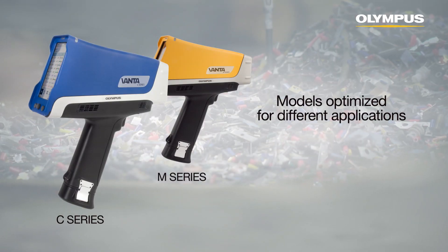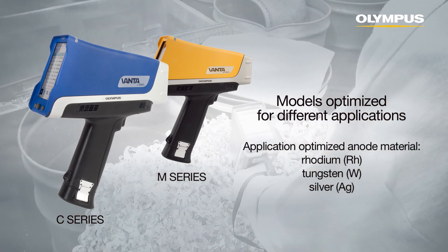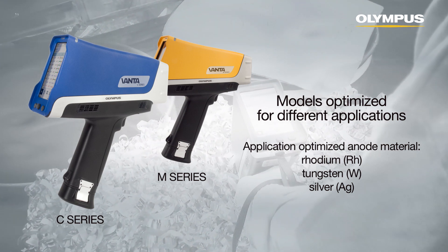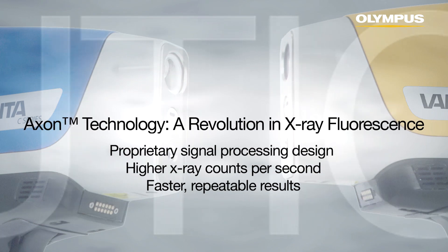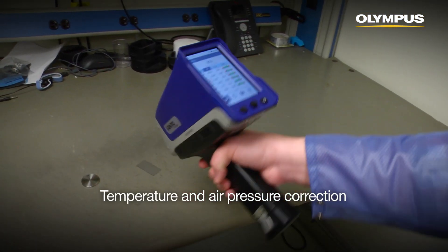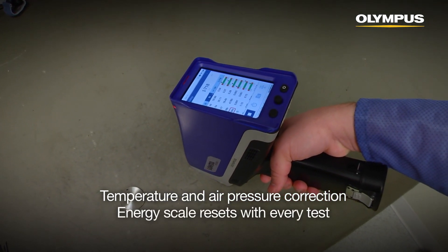Vanta analyzers are available in a variety of different models optimized for your application. Choose an analyzer with either rhodium, tungsten, or silver anodes depending on your analytical needs. Every Vanta is powered by Olympus' revolutionary new Axon technology for higher x-ray counts per second and fast results. The analyzer software automatically corrects for temperature and air pressure and resets the energy scale with every test for accuracy.